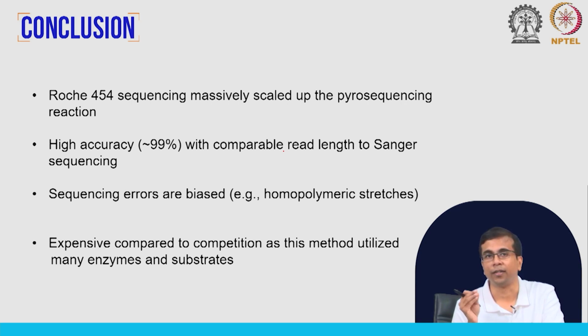It allowed researchers to do a lot of fantastic work, and even today you will see a lot of data in databases. In case you analyze this data, you need to keep these drawbacks in mind. For example, if you are looking at homopolymeric stretches, you need to be very careful with the analysis.